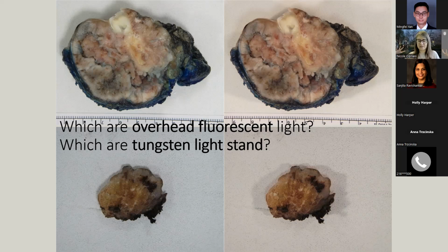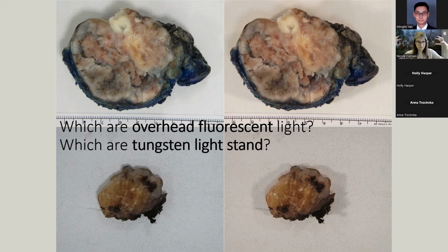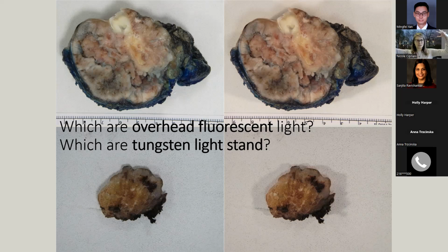So in our lab, the fluorescents are just these big wads overhead, right? And the tungstens are closer down and at an angle. So you can see how the shadows on the right, on the light stand tungsten, are longer, right? Because the light is closer and at more of an angle. The shadows on the left, on the fluorescent, are really tight because the light is just coming directly from overhead. So you can guesstimate the angle of the light based on these shadows that are cast.